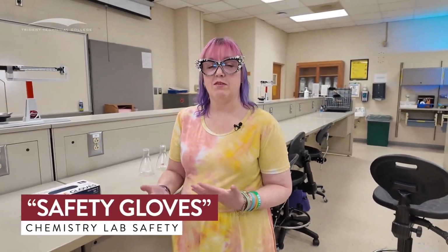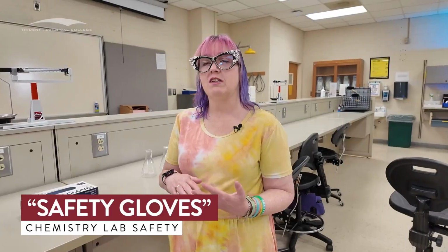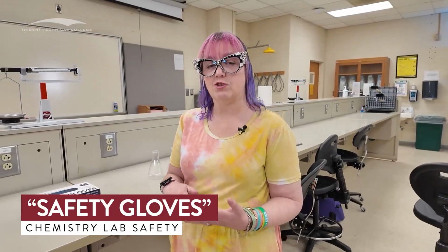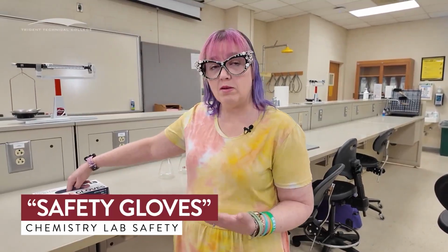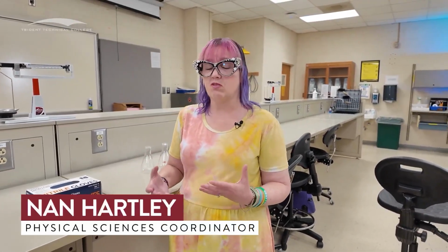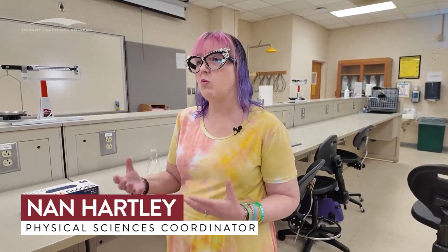So we've got a couple of experiments where we specifically need to be worried about our glove protocols. And those experiments are the solution concentration, the titration standardization, and the titration for the vinegar concentration. So when we talk about those experiments, it's absolutely necessary that we wear gloves for the entire experiments. For the other experiments, gloves are recommended. They're not necessarily necessary. It's never that we don't want you to wear them, but you don't have to wear them for the other experiments.